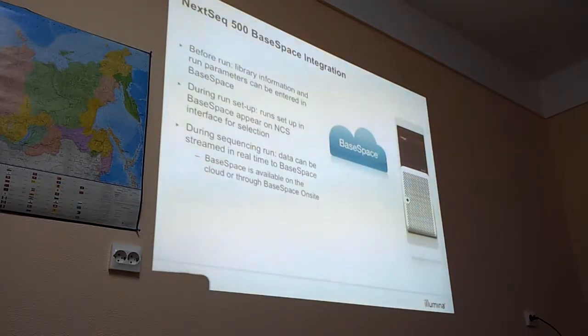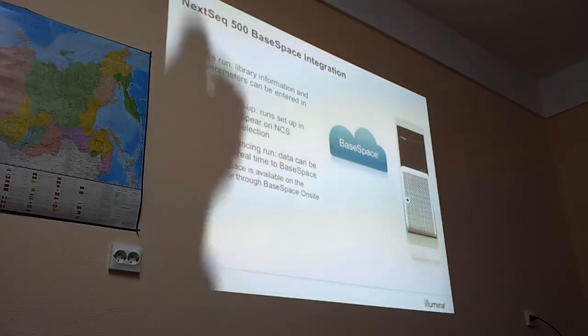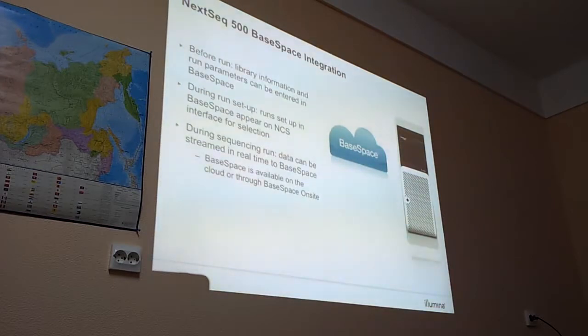Then it will temporarily save it on the hard disk, and then it will continuously try to upload it to the cloud. I think it tries for at least 2 days. If it's broken for longer, then maybe you have to transfer it manually later.